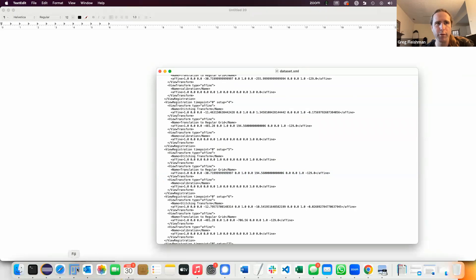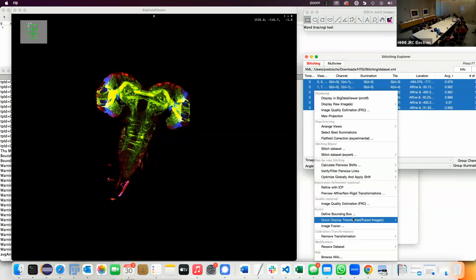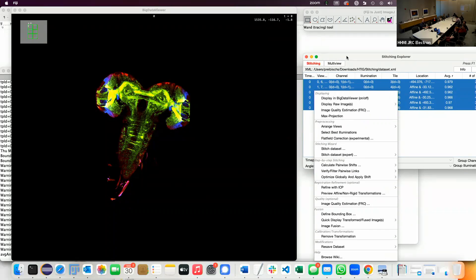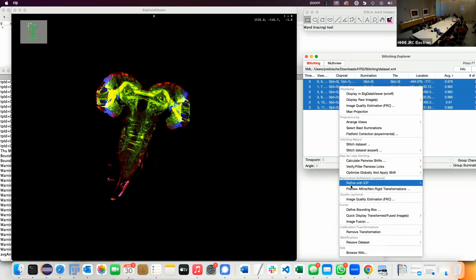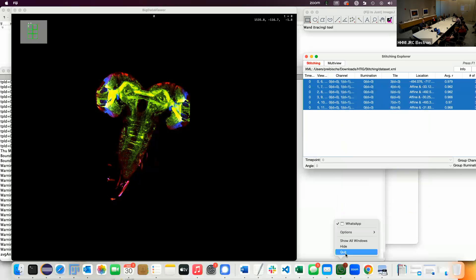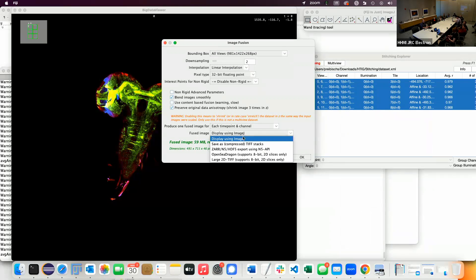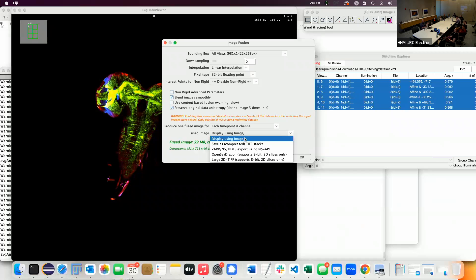You can also do things like remove the latest transformation if you're not happy — you simply remove it and go one step back. Then to export, the easiest option is to display it as an image in ImageJ — it pops up as an ImagePlus. The problem is this can be too big for large datasets. You also don't want to save as a compressed TIFF stack for large data because it calls the image save function which fails if it doesn't fit into RAM or if XY is more than 2 billion pixels. For large data there's the ZAR and HDF5 export which uses the N5 API — you can save almost arbitrarily sized images because it just processes each block.